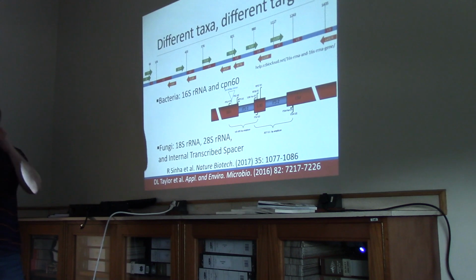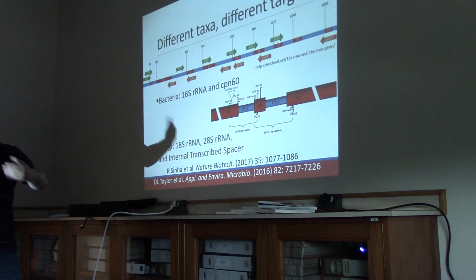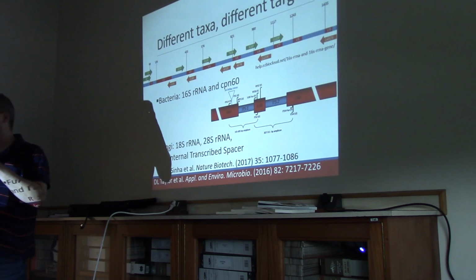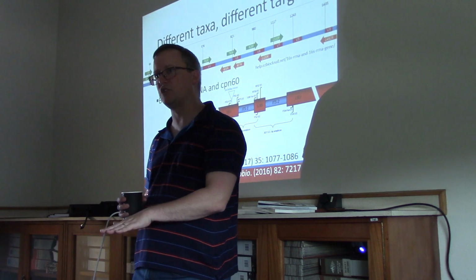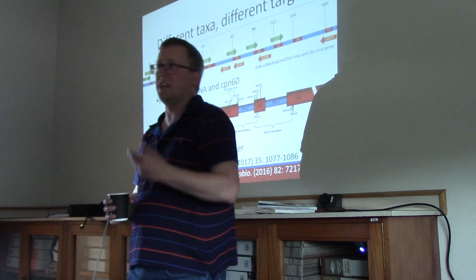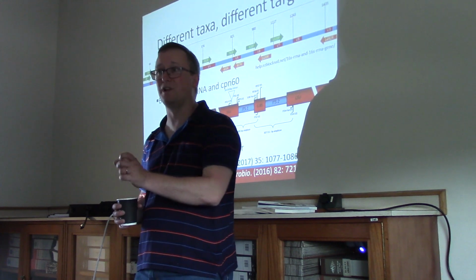Okay. So producing a longer segment, having a little more space between the primers, gives you a better amplification. A better amplification or a better ability to retain the fragment you've produced? No, I'm talking about the bands now when you amplify, on the gels. Right, generally speaking, you're not going to attempt to infer the species by how the band migrates on the gel. You expect the length of the thing to be roughly the same across species. But if you're just trying to make sure that the amplification worked and you're doing it by gel, if it's too small a fragment, you're not going to see much.